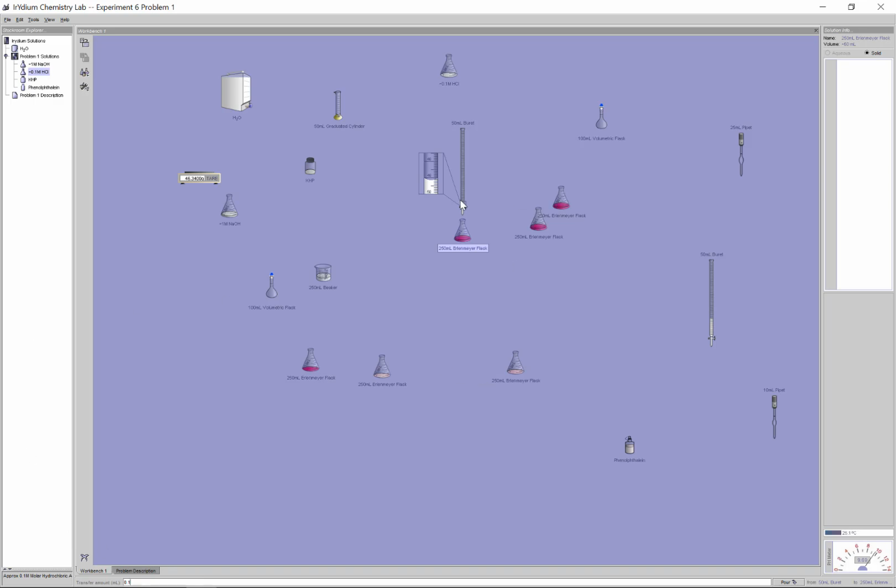You notice here I was really pushing the mark here. If I went past the 50 mark here, there is still a little bit of leftover volume in the burette, but with no markings, I can't actually read it. This is sort of the last milliliter that I had here. Fortunately for us, we can take down this reading here. So 49.18. And then what we're going to do here is we're going to flip over to the OneNote. I'll show you some of these calculations and we'll see how we did.